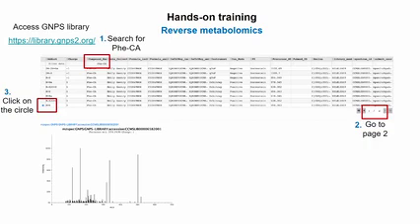But it's important to keep in mind that, at this point, everything that you see here is just based on spectral matching, cosine matching, right? So it does not check if specific diagnostic fragments are there or not. They might be or not. As long as they don't affect the cosine too much, they won't be considered for this match, and you will get a hit whether this diagnostic fragment is there or not. There are other strategies where you can consider that, but that's not what we are discussing here in this context.